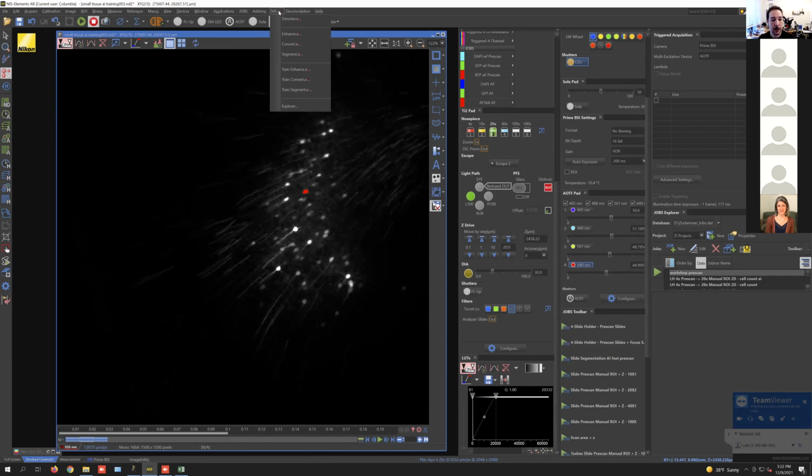It's obviously looking at intensity information, but it's also using a lot of spatial information in the image, so texture and things like that. And so it's fairly robust to things like that. Okay, cool. Thanks. No worries.